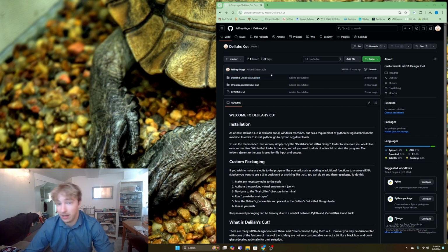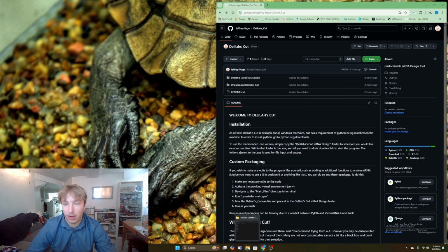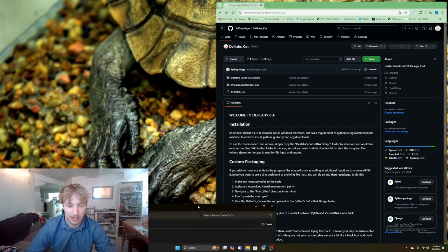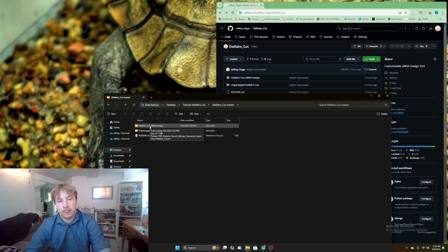If you want to actually edit the program and then repackage it yourself, adding a couple functions or whatever, you can do that too, and that's more in this folder. But with GitHub, it's a lot simpler to just download everything, so you can download the zip and then unpackage it wherever you see fit. And I already did this prior to this video just to make it as simple as possible, but it's a very simple process, and it'll lead you to getting this folder, which is the master branch of this. And then you can see this folder right here is what you really care about. And this README has all this information here.